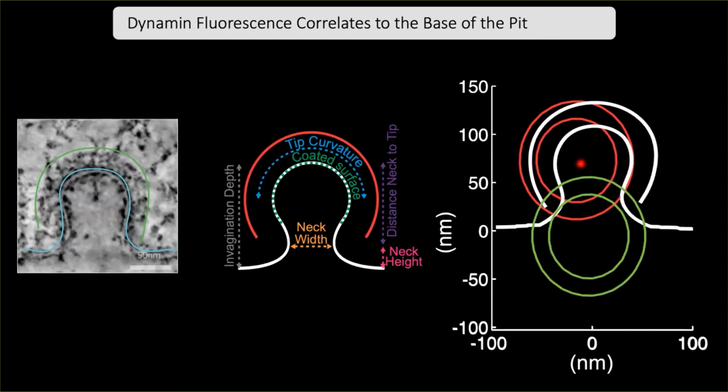basically, what is the probability that the signals overlap? What is the probability that they are positioned, for example, at the base? So what you're seeing here at the center of this circle is the maximum probability. Since this is the depiction of the average coat, the maximum probability, or the center of mass of that coat, is here. This gives you a more or less representation of the error that we have, because the real center of mass is somewhere here, and it's shifted. And there is a 10-fold decrease in probability the more you move out of the circle.